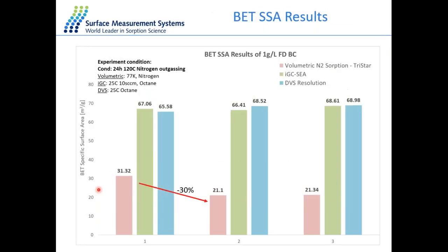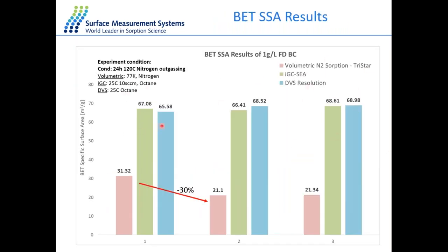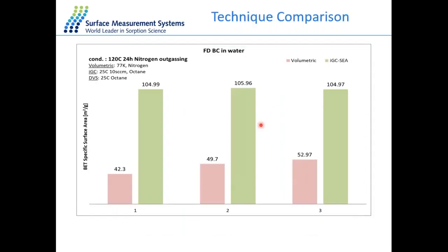So just to confirm these results and to look at it a bit further, we ran the same material again, over and over, with continued outgassing between each run. Again, this is a different material, not the same one. This was around 60. It is a different batch.